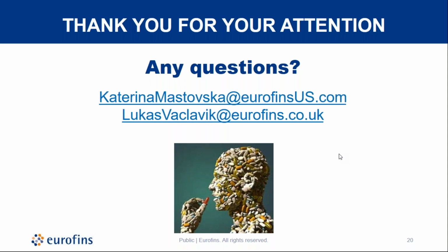Yeah, I totally agree. Matrix effects we observe are in some cases really extreme, and due to large differences in respective test samples we obtain for testing, we cannot really use matrix matched calibration. It's possible in certain cases, but not always. Which leaves us with several additional options. We can try to dilute out the matrix effects, which typically affects the LOQ and reporting limit. The other option is the use of isotope labeled internal standards that typically allow for effective compensation of matrix effects, and we are trying to include those in our methods as frequently as possible.